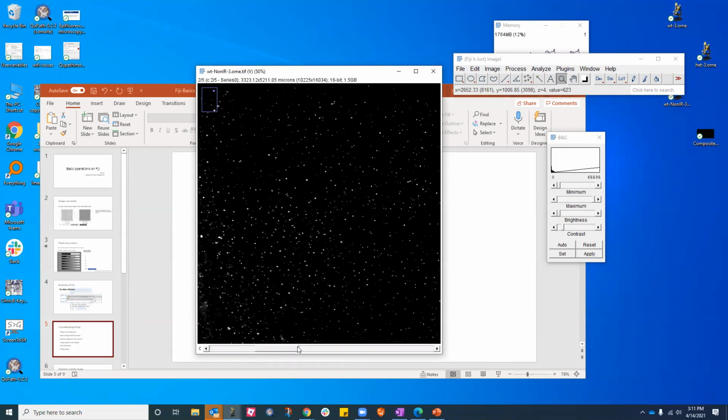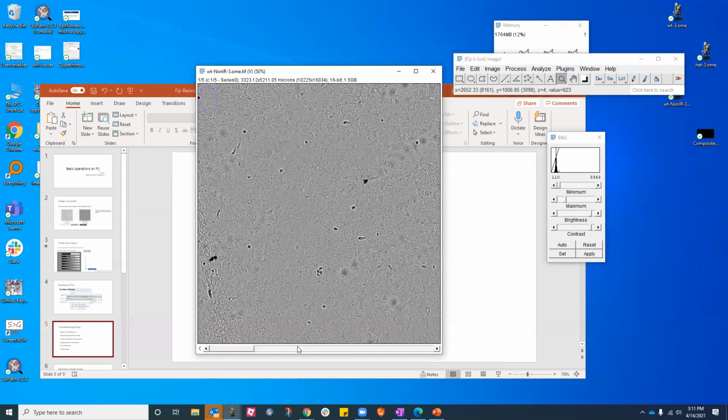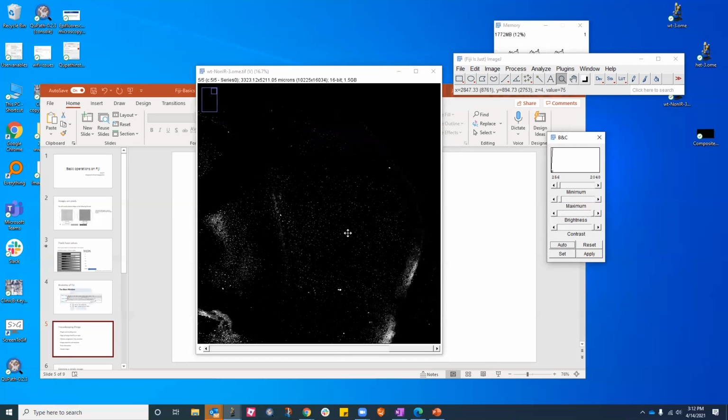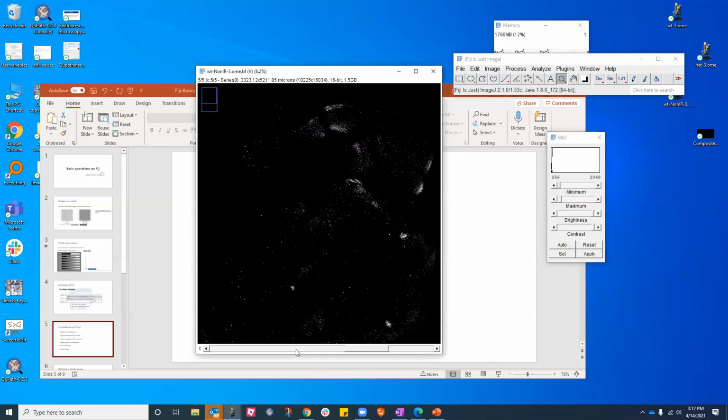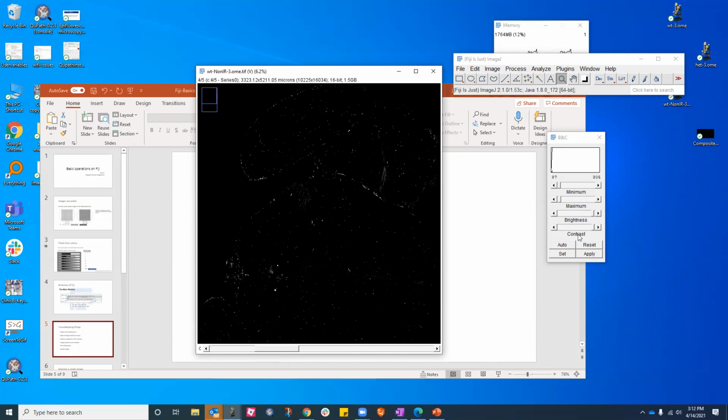And you will hear a lot of shortcuts that I'll talk about in order to access some of the features of Fiji. So let's go back. I want to go back to my second channel, which I know is DAPI.